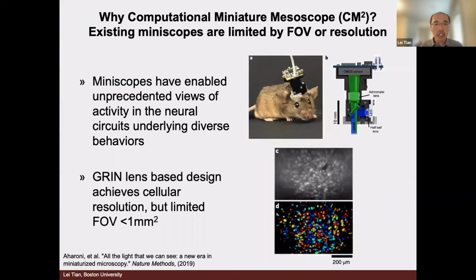On the right, this shows a breakdown of a standard Miniscope. What you can see is that from an optics perspective, it uses the same beamline as a tabletop fluorescent wide field microscope, so you have the objective lens and you have the excitation filter, dichroic mirror, etc.